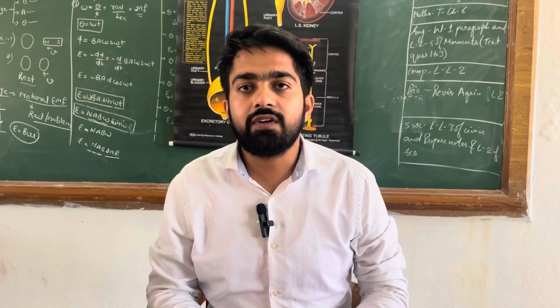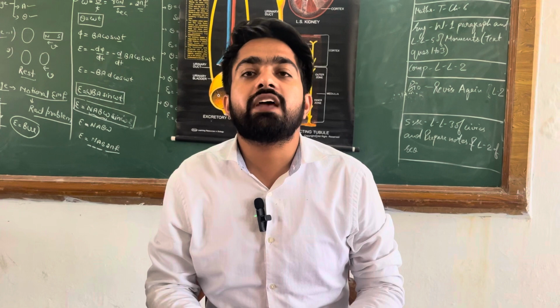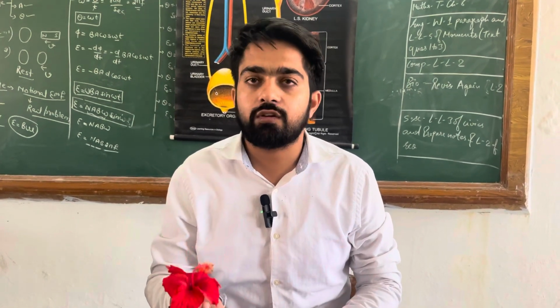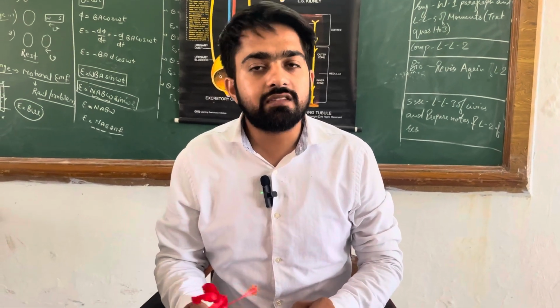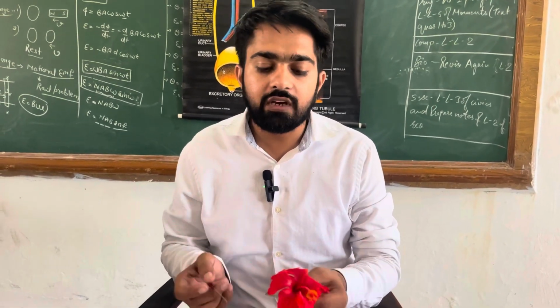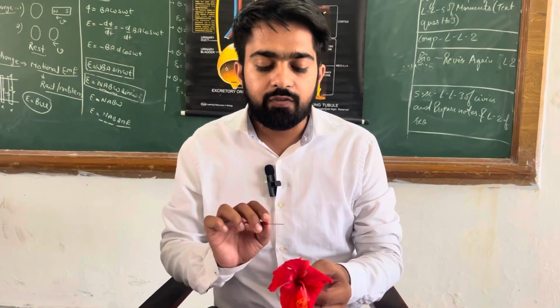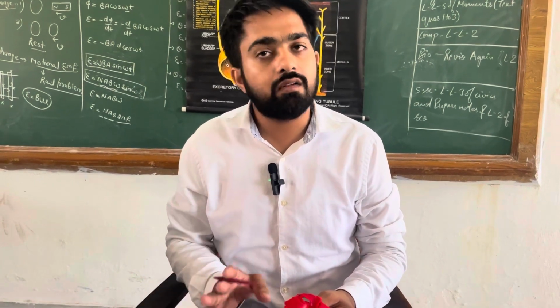Today we are here with our new experiment in the experimental series, that is the dissection of Hibiscus rosa-sinensis, or you can say China rose. So let's start with this bisexual flower. Why is it considered bisexual? Because it consists of both male reproductive organ as well as female reproductive organ. Therefore, it is considered a bisexual flower.